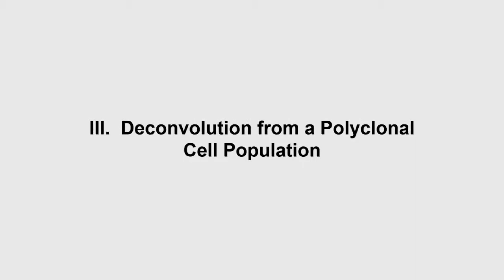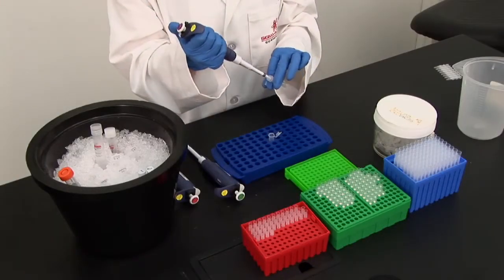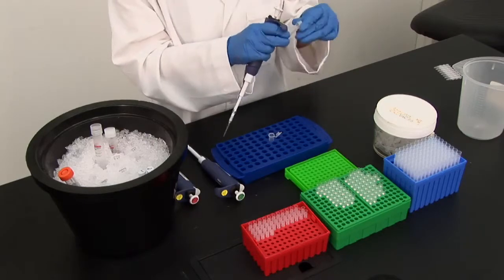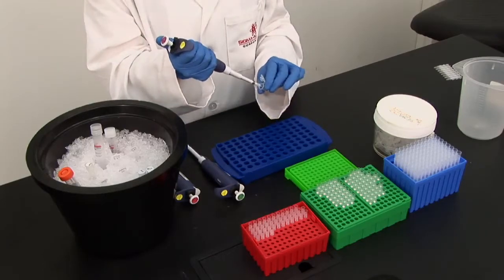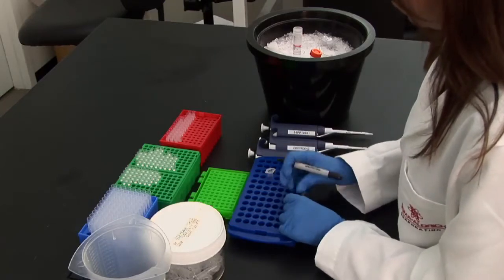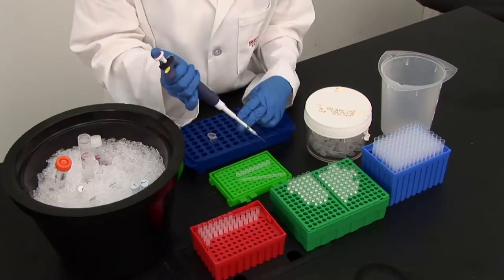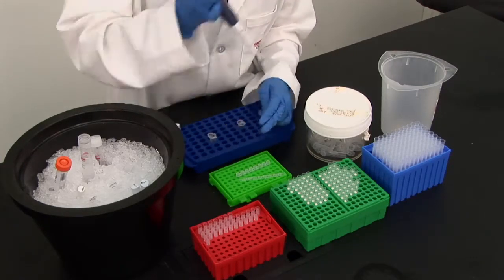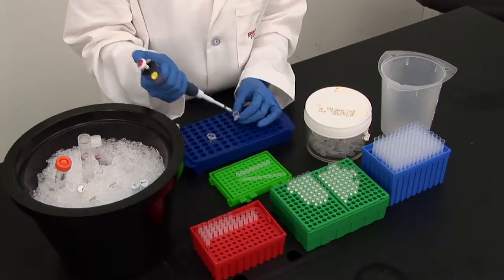To perform polyclonal deconvolution, the heterogeneous population of cells is harvested from each subpool and the genomic DNA is isolated. Begin the shRNA template recovery procedure with setup of the PCR reaction as described in the written protocol. Amplification primers at a concentration of 20 micromolar are included with the Lentiplex kit. Prepare a positive control using the Mission shRNA human positive control vector diluted to the appropriate concentration as a template. Successful amplification with this template indicates that the PCR assay components and cycling conditions are adequate.